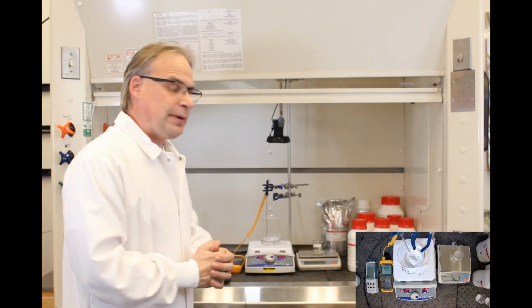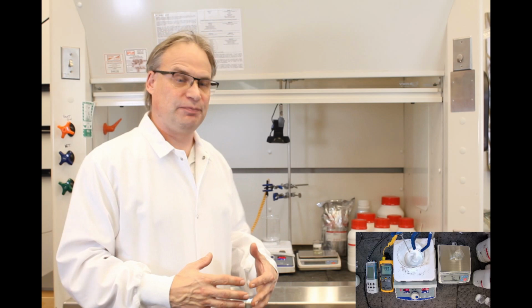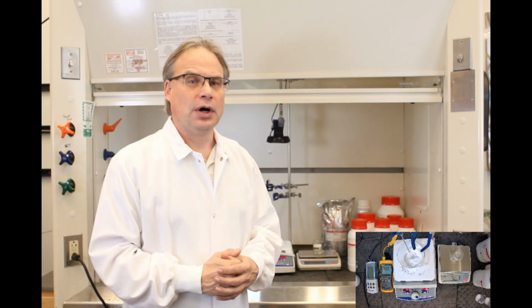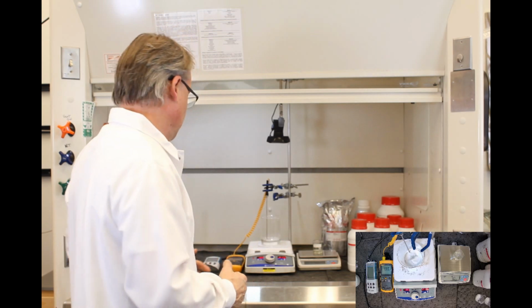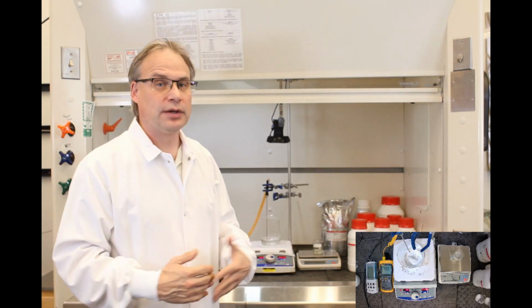From a do-it-yourself perspective, I recommend doing it in a carrier. One, it allows you to dilute the nicotine, and that's important because pure nicotine is very dangerous. It's extremely toxic. It has a very, very low lethal dose. 100 milligrams or so will put you down. So you've got to be careful. You should be wearing the right stuff. You ideally should have a fume hood like this, and you should have the proper gloves and protective PPE to ensure that you don't get splashed. One drop of it will get absorbed very quickly and will cause you serious harm or death.